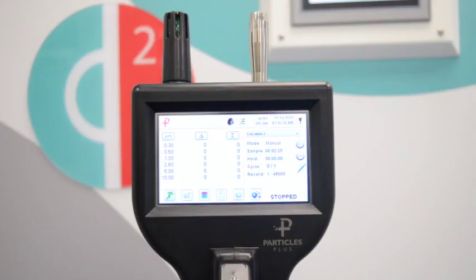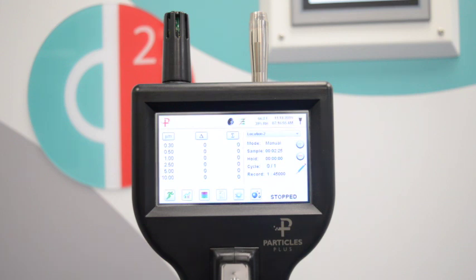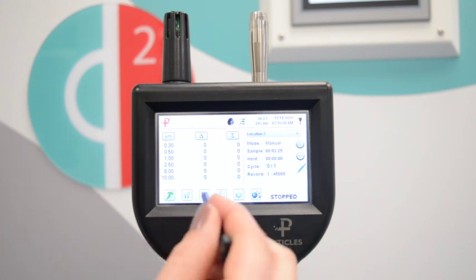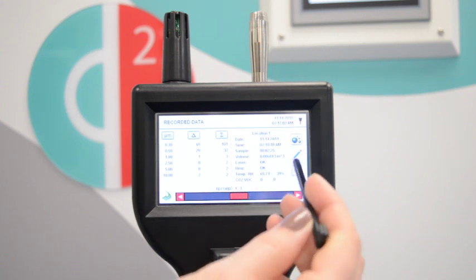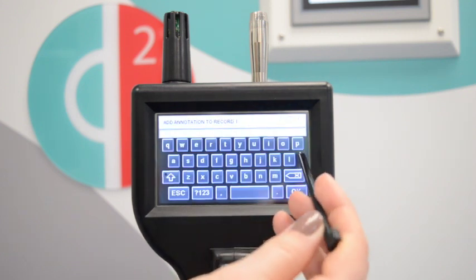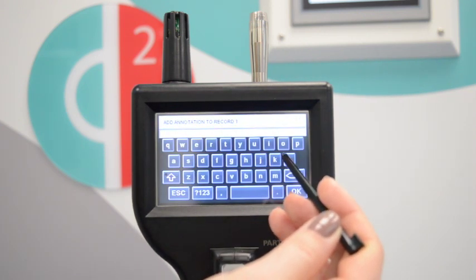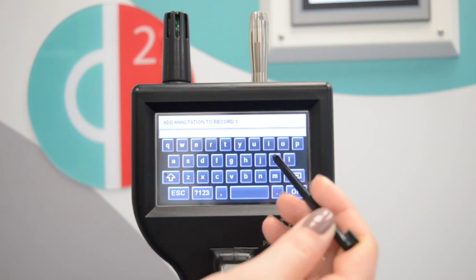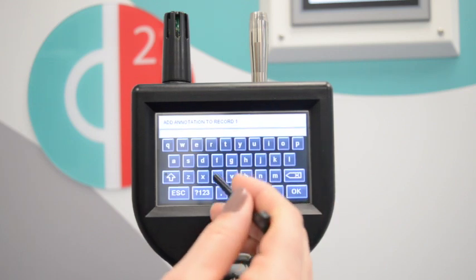You are able to add annotations to sample records, which is most frequently used in cases where you haven't got a clear indication of where you've taken the count. For example, if you have a facility with multiple rooms and each starts at location one, you might want to use the annotation to note the room reference. This will then be exported with the data. To add an annotation, view the data record, go to the little pencil and add an annotation, for example, cleanroom 2.